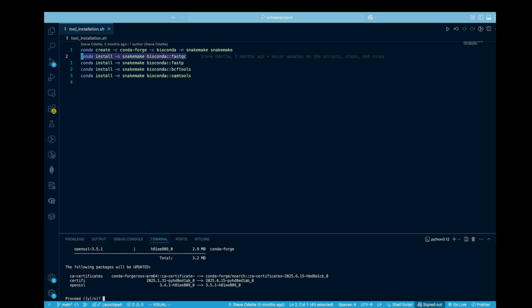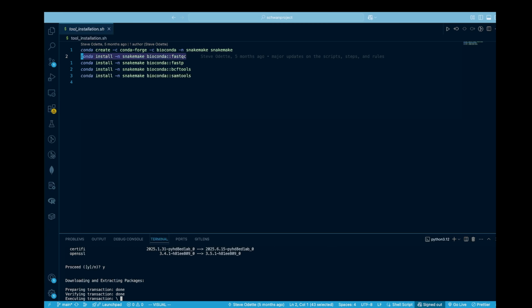So Conda will ask me whether it needs to install the additional dependencies that this tool needs. I just click on yes. And then just like that, our tool has been installed. I can simply use it whenever I want. So do this for all the tools that we will have, and then you will have a successful run throughout your analysis.